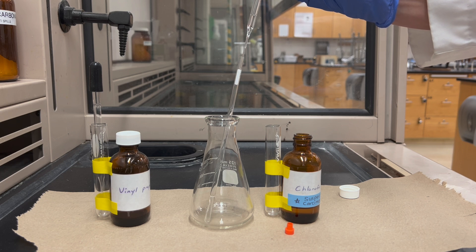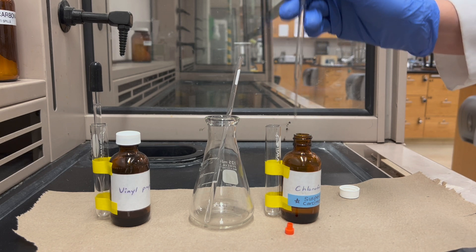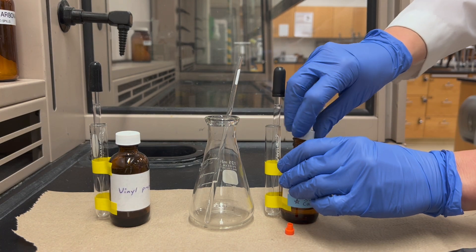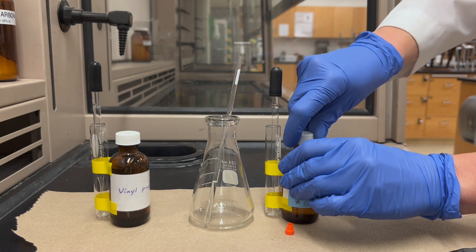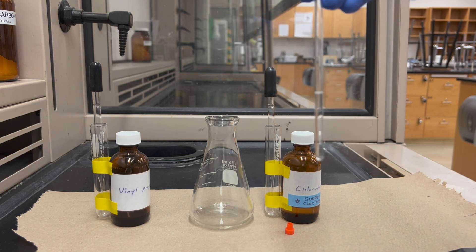Then you can add that to your NMR tube and you want to fill it up to about one and a half inches high. If you have extra you can actually put that back into the reagent jar, especially if you know that pipette is clean. Deuterochloroform is actually quite expensive so we don't want to waste it.